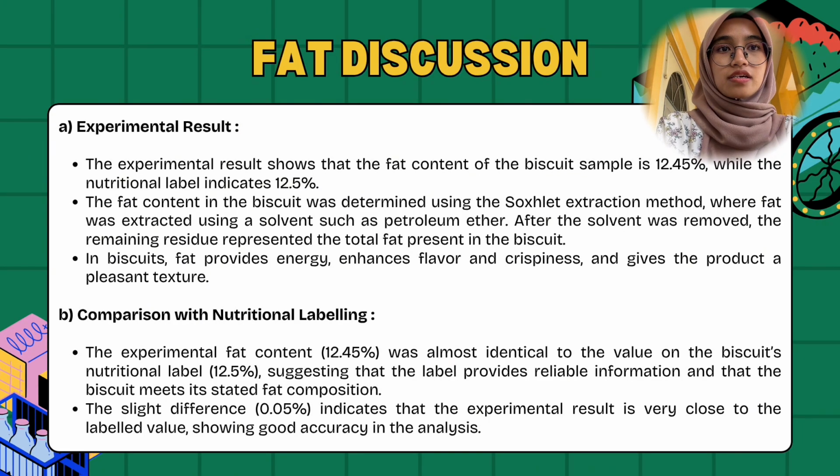When comparing both values, the difference is only 0.05%, which shows that the experimental procedure was accurate and the nutritional label is trustworthy. This also indicates good accuracy in our fat determination process.